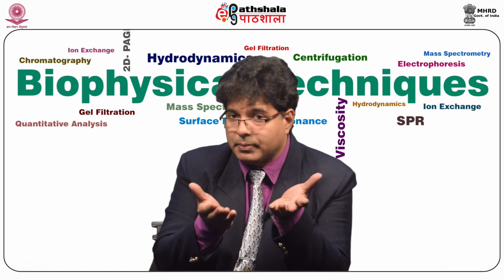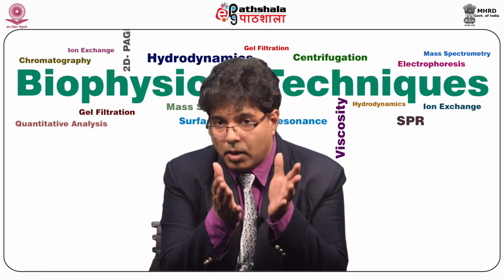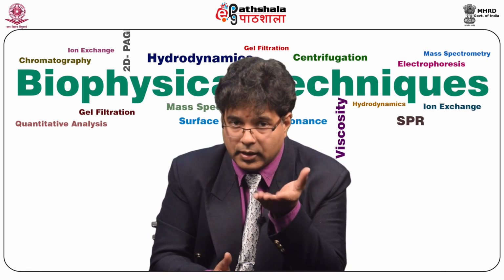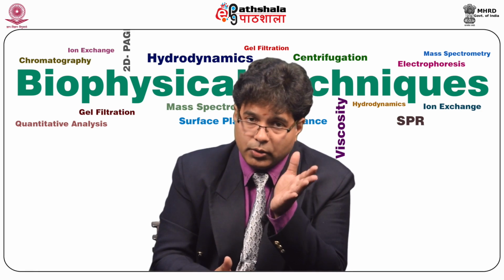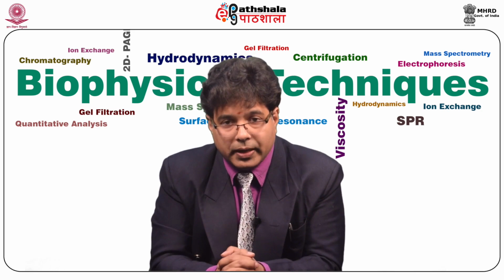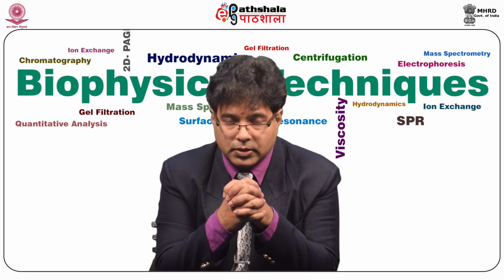When it comes to multiply protonated compounds like peptides or proteins, you will see a value of, say, 250, but the original molecular weight may be 20 kD. Since it is multiply protonated, the basic fundamental of mass spectrometry is m plus z divided by z, that is, mass plus charge by charge. So if you have 20 charges, the molecular mass plus 20 divided by 20 comes down to a very small value. But that is not its molecular weight. This determination is done by calculation, considering how much resolution we get in the isotopes. Therefore, mass accuracy is a very important parameter in a mass spectrometer.